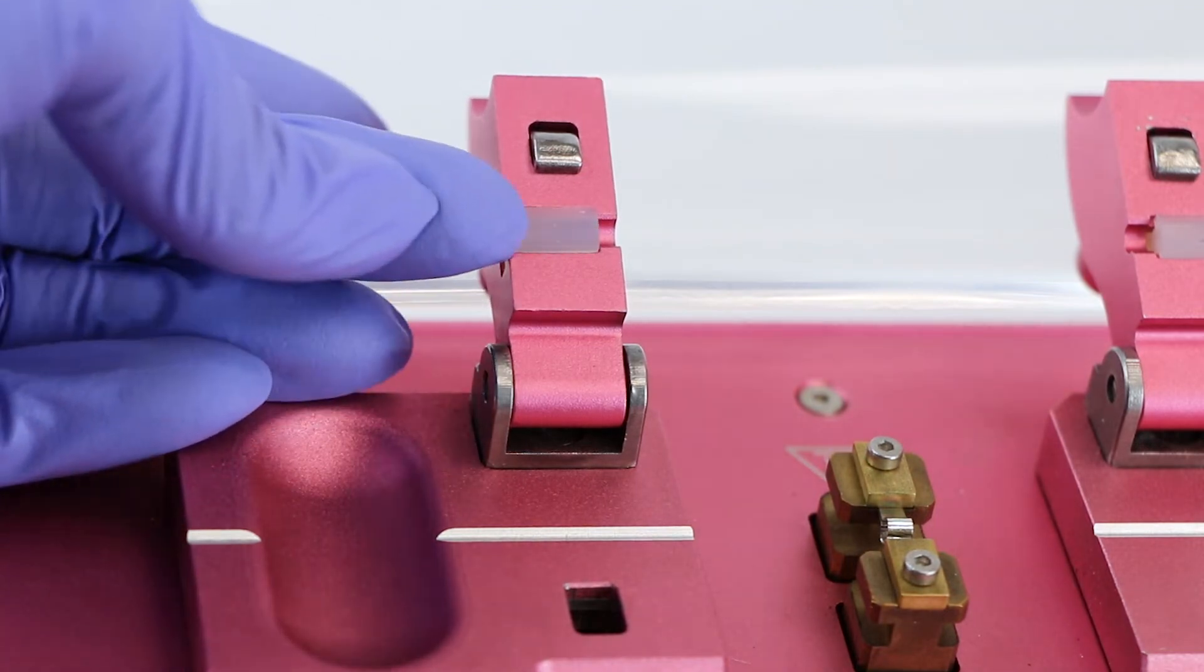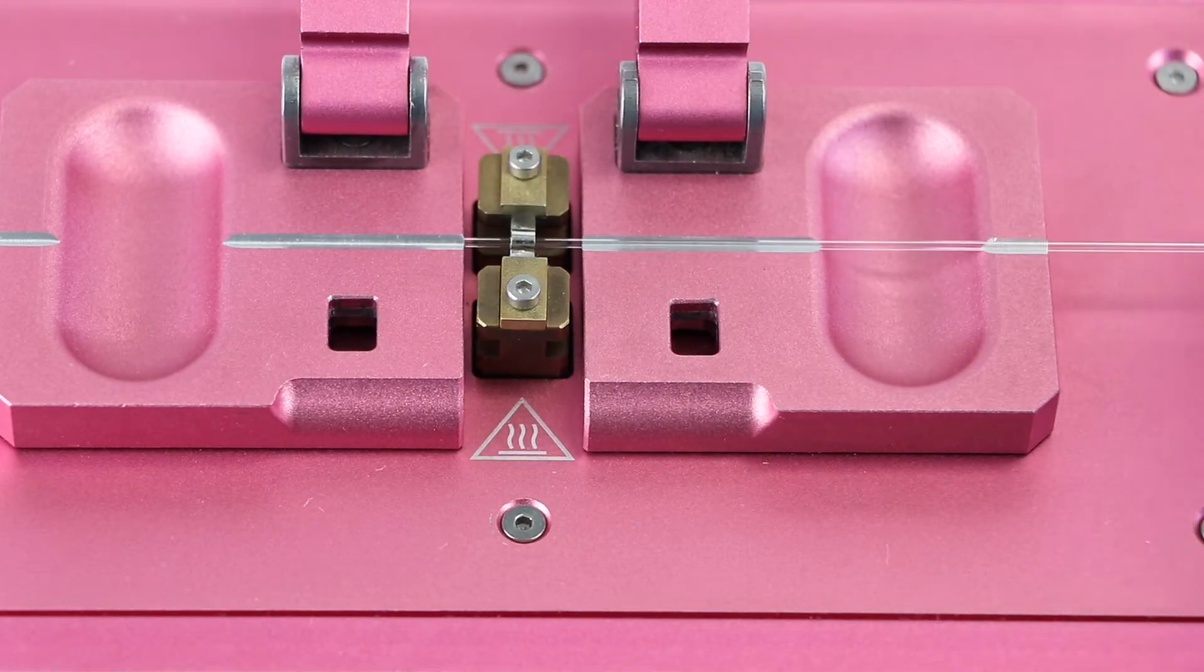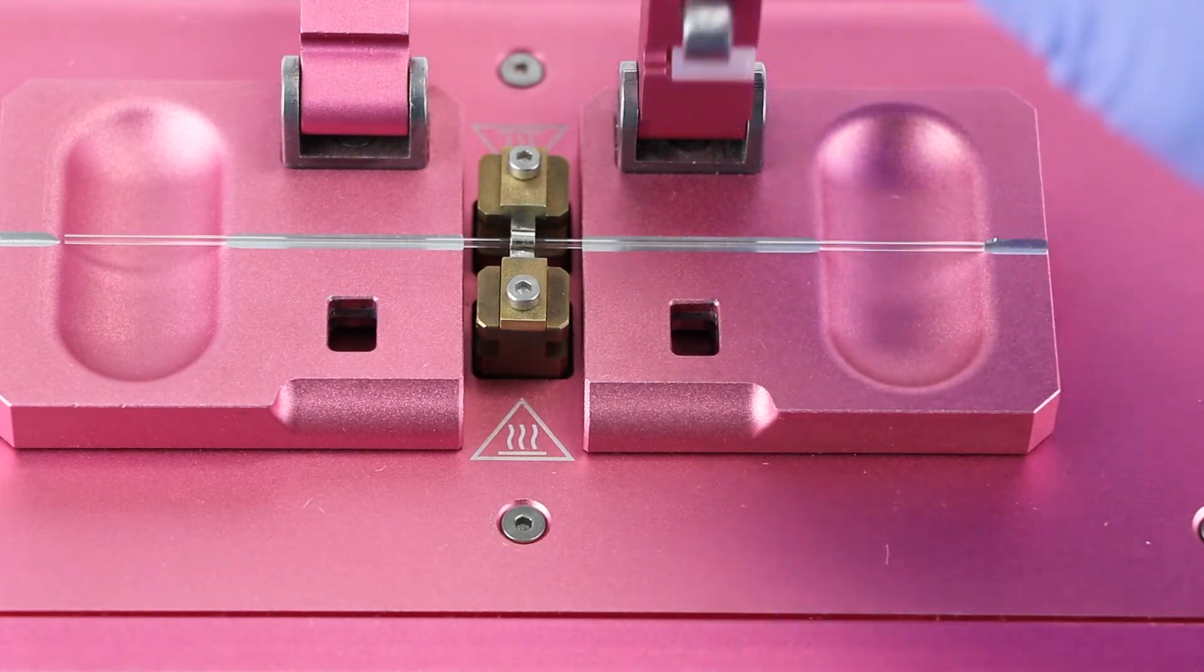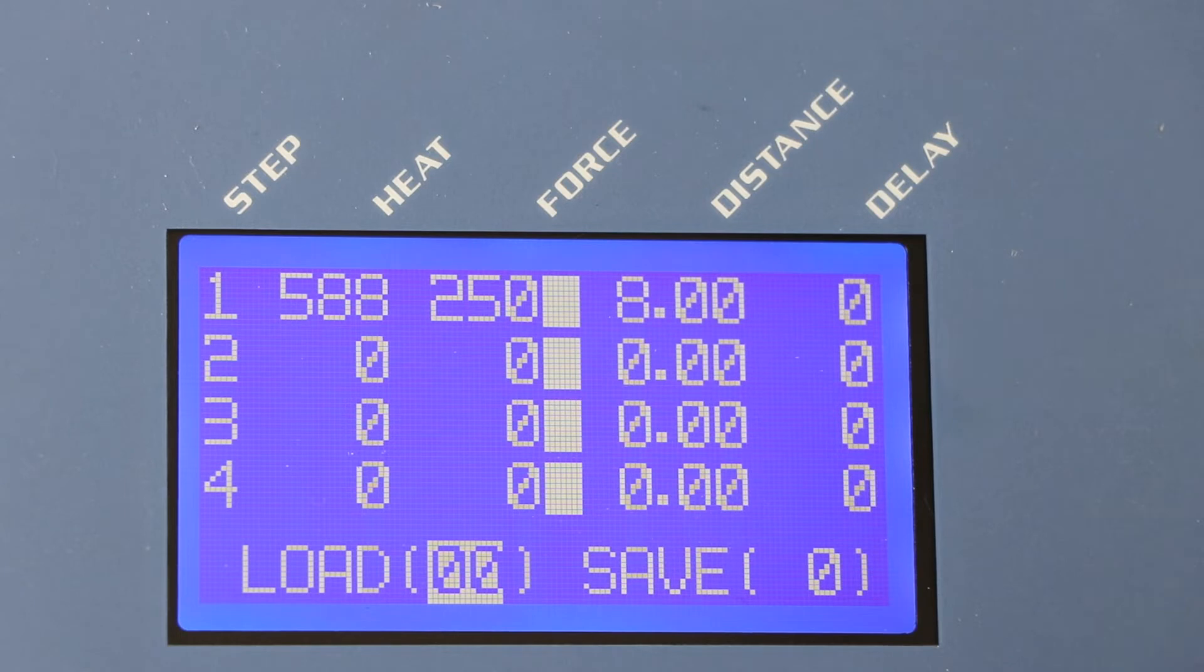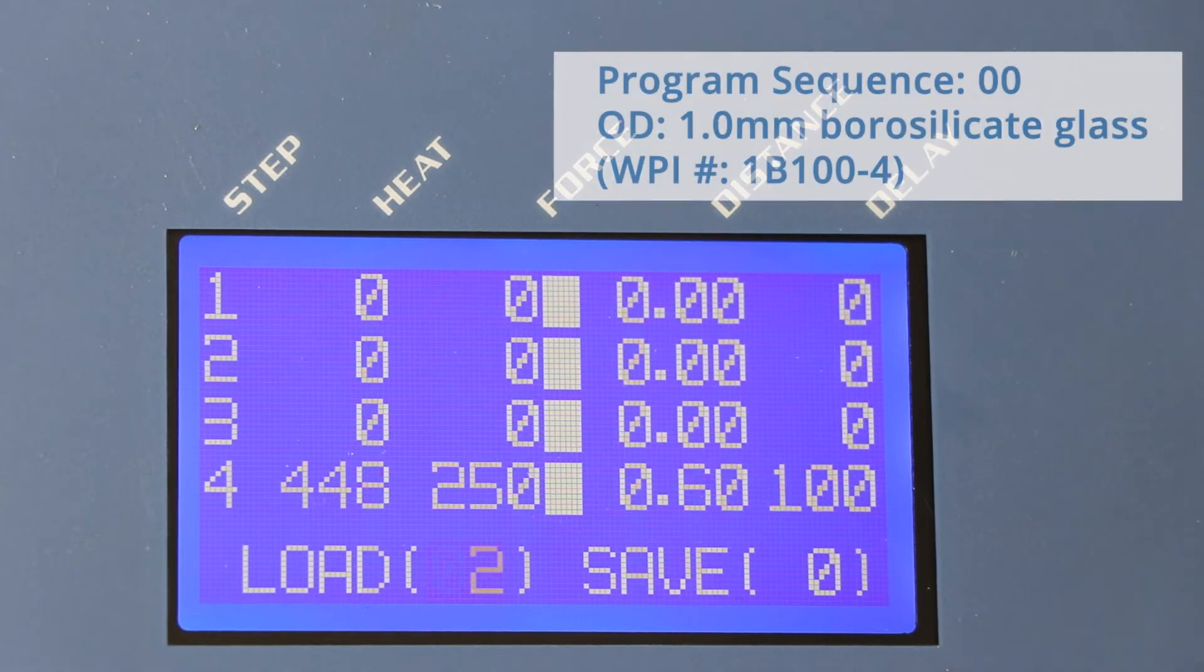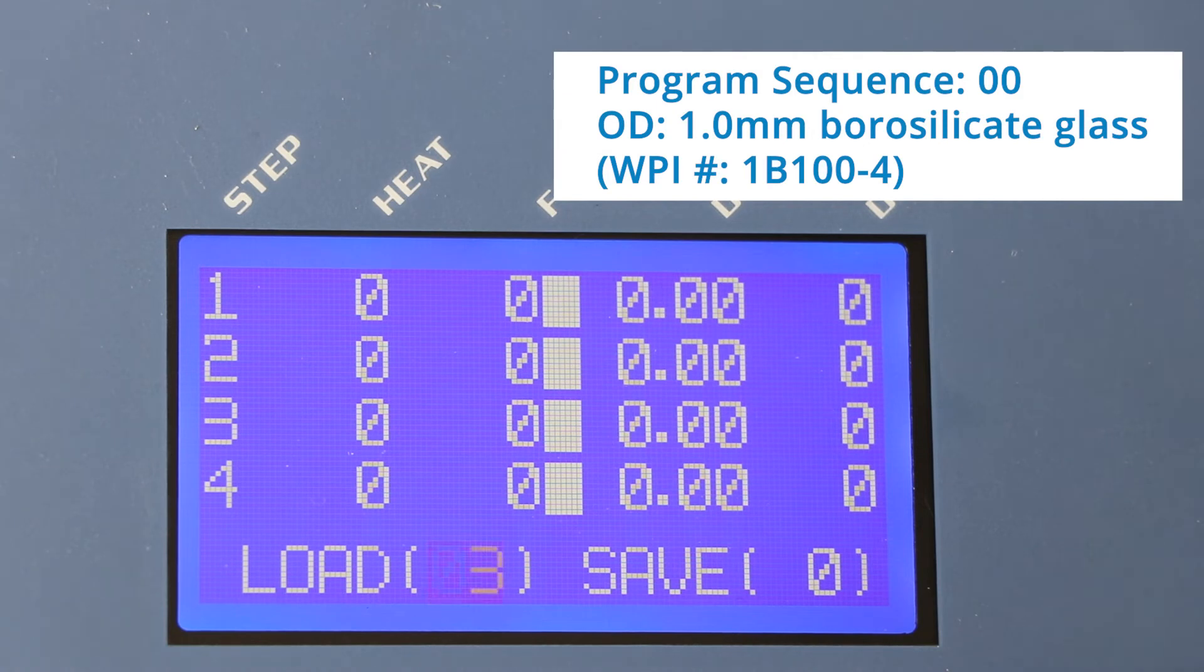Mount the glass capillary onto the carriage and secure it with the glass clamps. On the LCD display, choose the correct sequence. If you do not have a sequence yet, choose one from the program storage. Program sequence 00 is designed for an outside diameter glass of 1.0 millimeter.